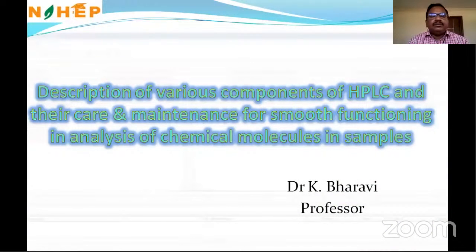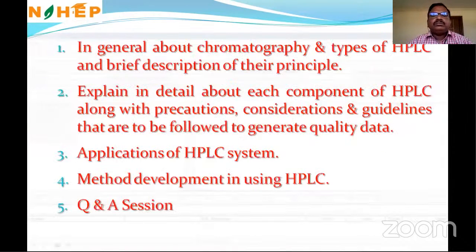Okay, today my topic is the description of various components of HPLC and their care and maintenance for smooth functioning in analysis of chemical molecules in samples. So now I will talk on these points. First I will talk in general about chromatography and types of HPLC and a brief description of their principles.